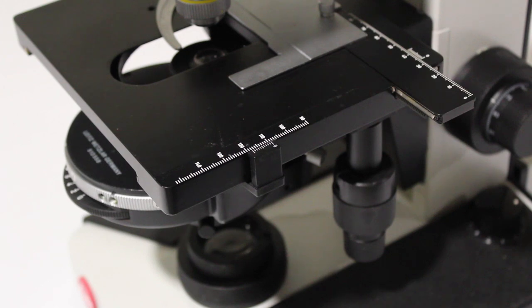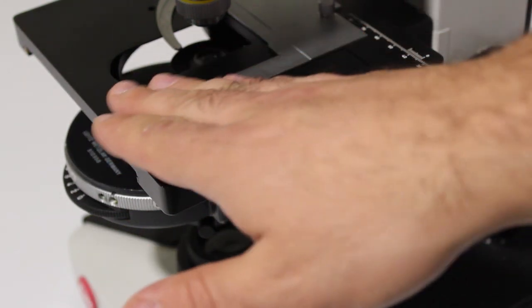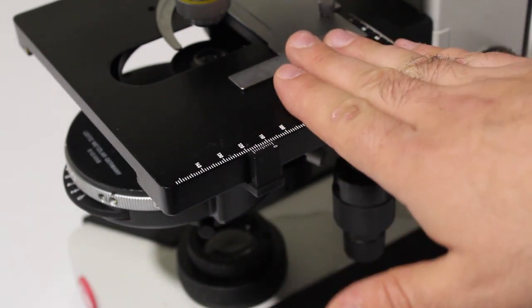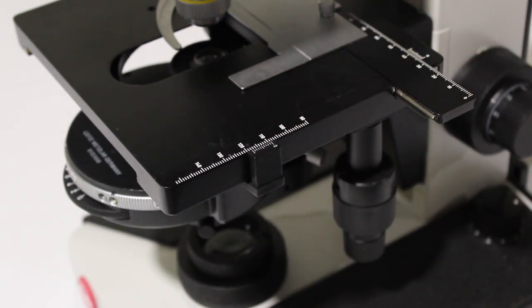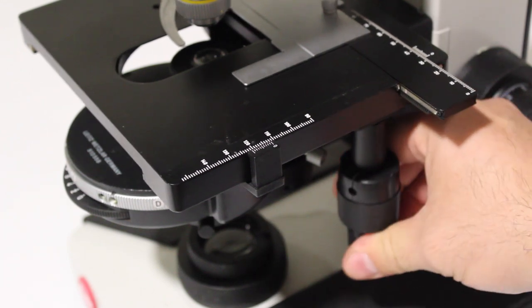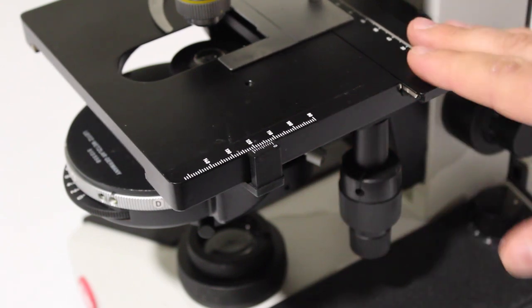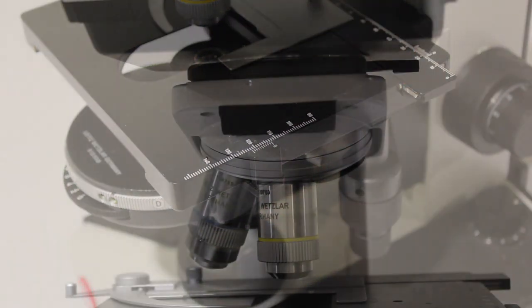Other microscopes will have a simpler stage, which is basically just a flat platform, often with some clips where you can slide a slide in and use the clips to hold it into place. On these stages, you have to use your hands to move your sample, which is fine in most cases, but it can be a little challenging at high magnification. So if you can afford it, a mechanical stage is great, but if you're budget conscious and you're looking to save some money, a mechanical stage is the first feature I would give up.